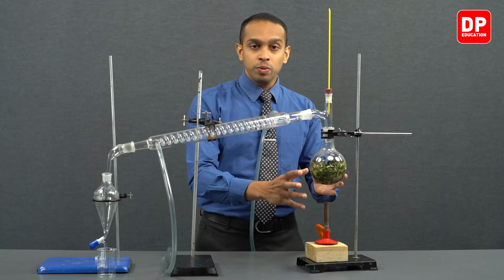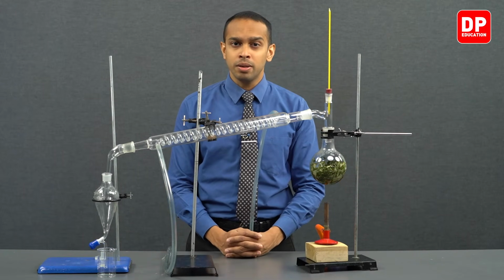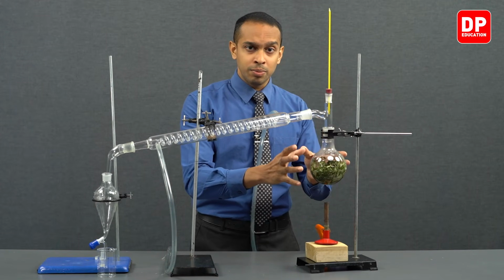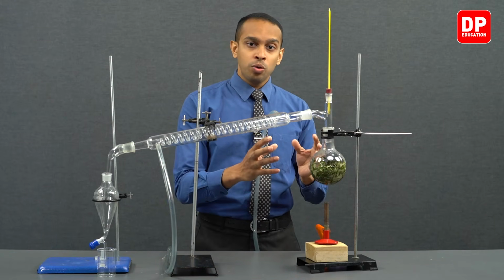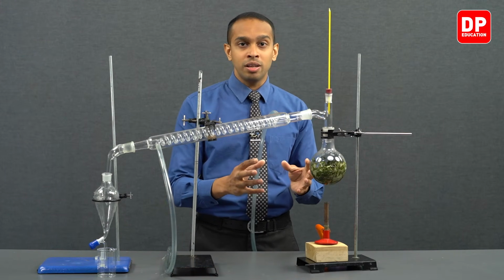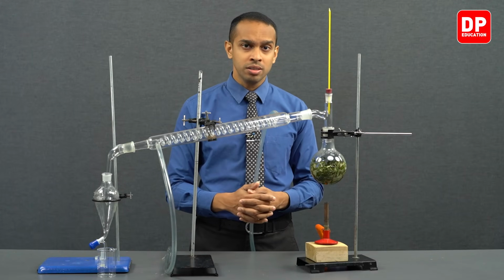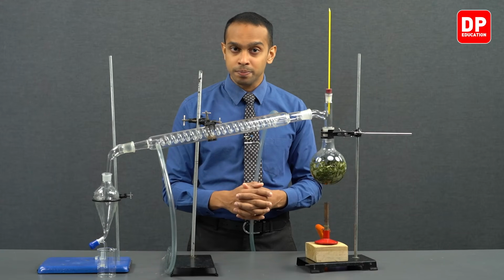Now, why do we use such an extraction setup to extract the essential oils that are seen in cinnamon leaves? When you have essential oils such as eugenol, which are volatile essential oils, they have a slightly higher boiling point.